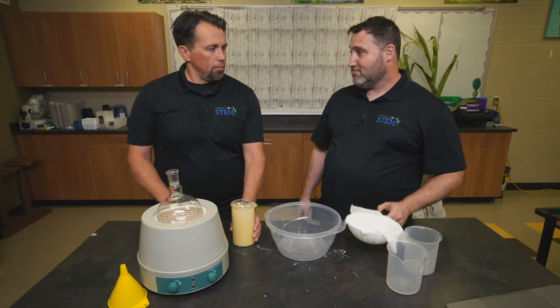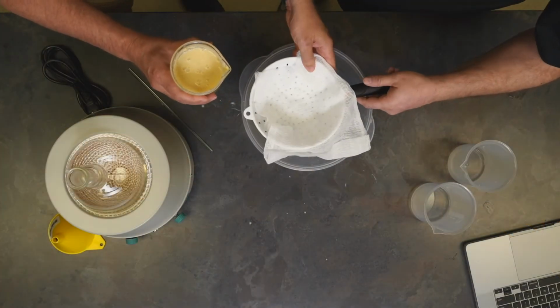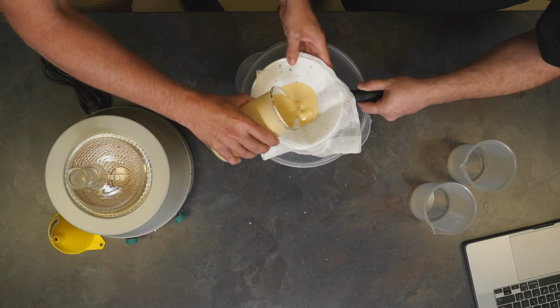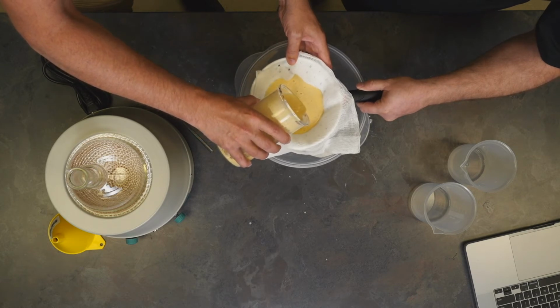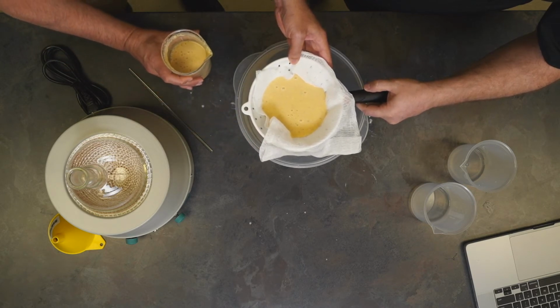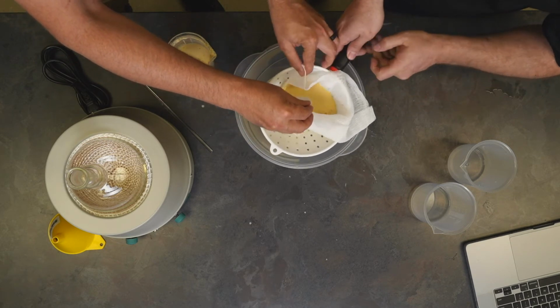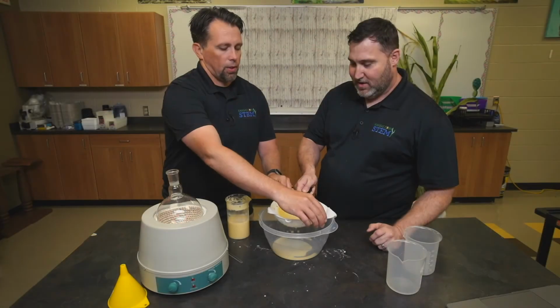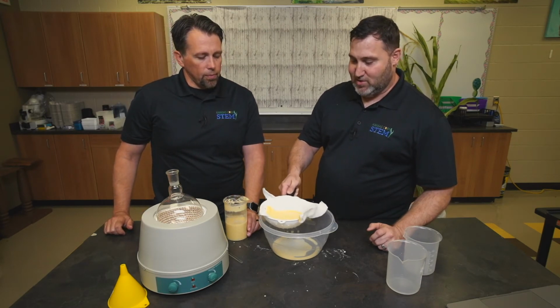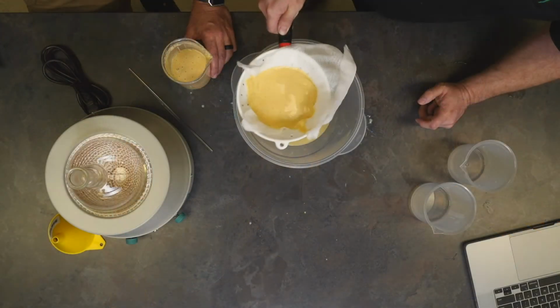So we're going to pour the solids through some cheesecloth and a strainer here to try to catch as much of the solid. We're after the liquid for the distillation part. Like Brian mentioned, we will lose some of the ethanol, but it does make cleanup a lot faster and easier. So let me swirl this a little bit. I like to do a little bit of a swirl technique. I think that helps it move through the cheesecloth and the strainer a little bit easier.